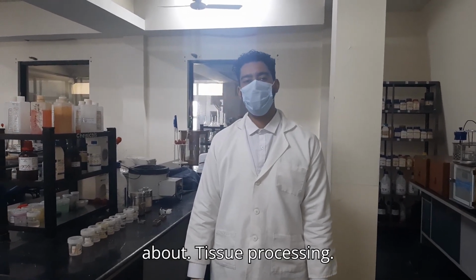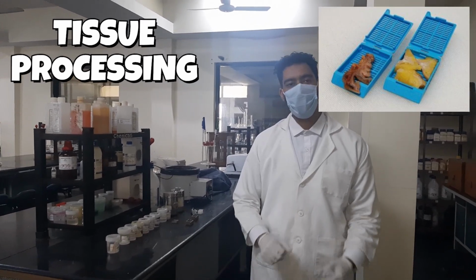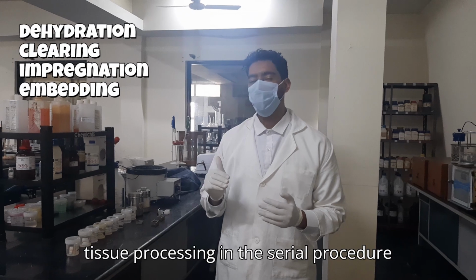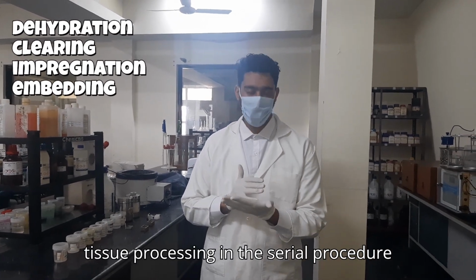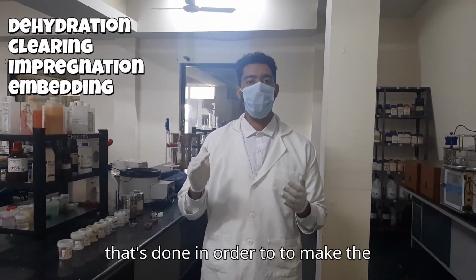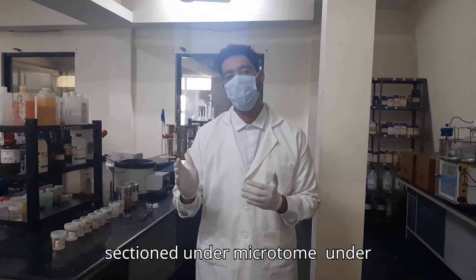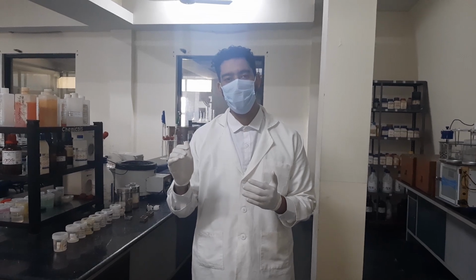Today I'll be talking about tissue processing. First of all, we need to know what tissue processing is in histopathology. Tissue processing is a serial procedure that's done in order to make the tissue hard, so that it can be sectioned under microtomy.